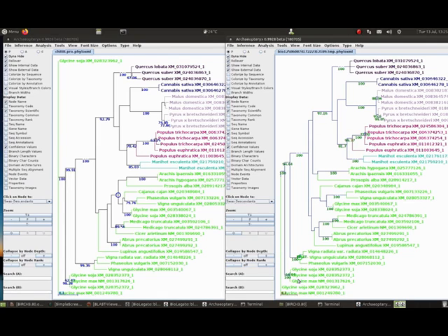Now we do have a case, for example, here in the soybean family, we have one set of genes and then some others which would be different paralogs of the same chitinase 3 gene. And so this is probably more ancient gene duplication that has persisted over time.